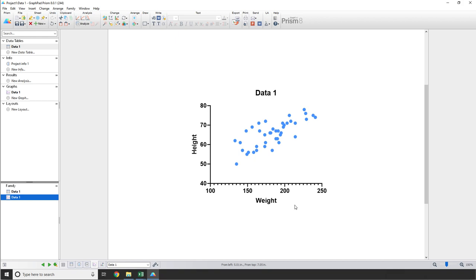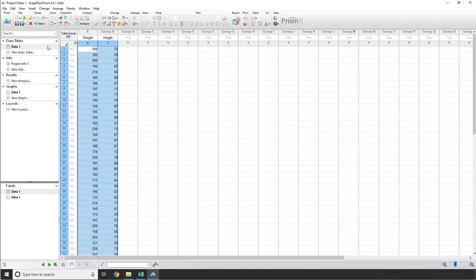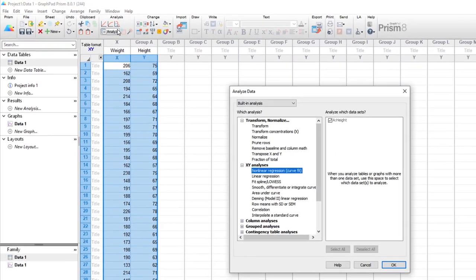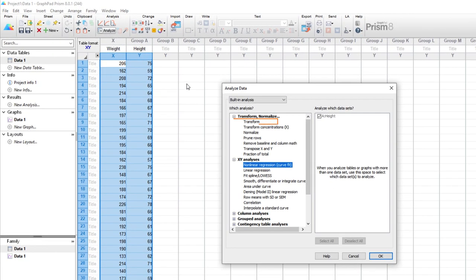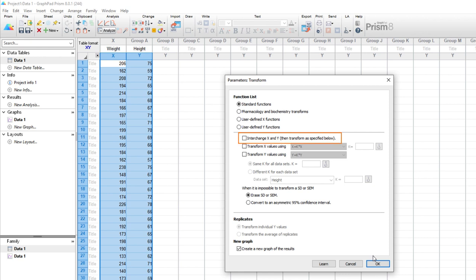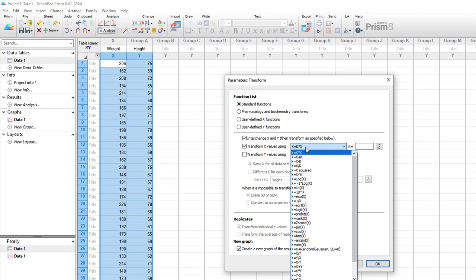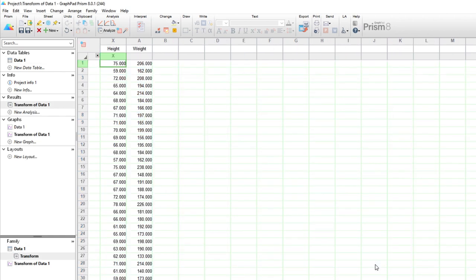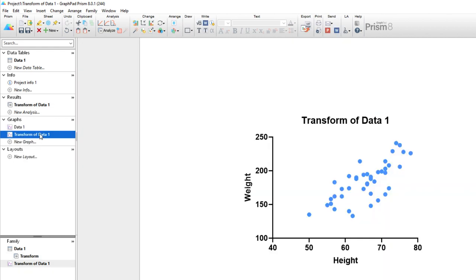But what if we wanted height to be X and weight to be Y? Well, the obvious answer is that you can manually adjust the data through a few series of copy and pasting steps. But it's possible to make mistakes this way, and there's another way that this can be done. If we go to Analyze, select Transform, and then check the box Interchange X and Y, this will achieve the effect we want, swapping the two groups so that height is X and weight is Y. In addition, using this dialog, you can apply a number of mathematical operations and transformations to your data. Make sure Create a new graph of the results is checked, and when we click OK, we're taken to a results sheet where you can see now that height is our X variable and weight is our Y variable, just as we wanted.